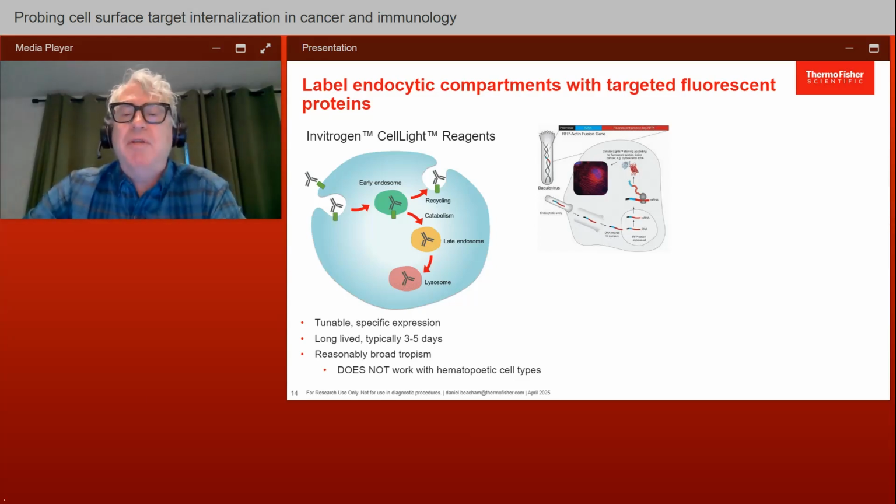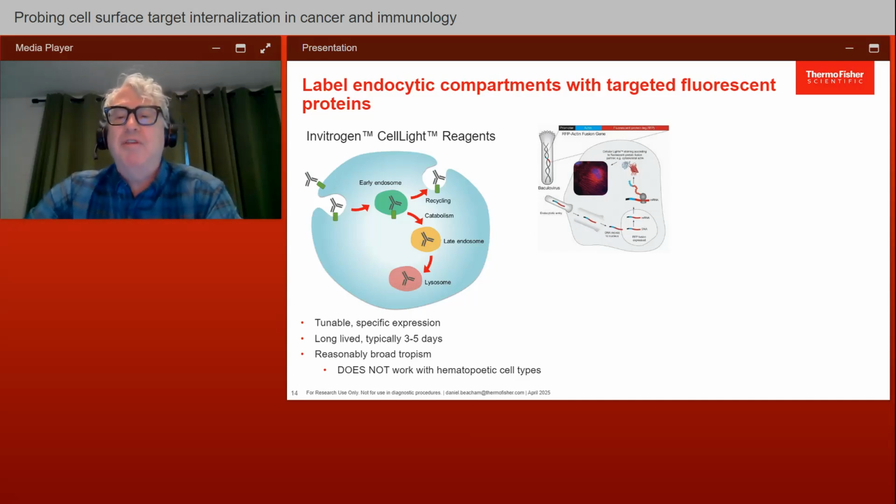And the magic here is that by virtue of a CMV promoter, you get selective expression of your gene payload, but the polyhedrin promoters of the virus itself are ignored by mammalian cells. So you have this nice purely episomal and transient transduction mechanism, and we use this to mark, by fusion to LAMP, Rab7 or Rab5, these compartments in the cells.